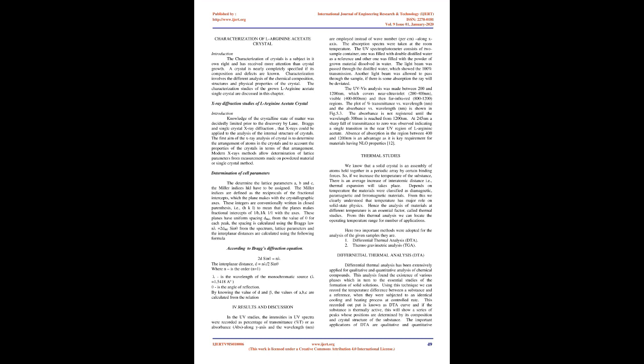X-ray diffraction studies of L-Arginine acetate crystal. Introduction. Knowledge of the crystalline state of matter was decidedly limited prior to the discovery by Laue, Bragg, and single crystal X-ray diffraction, that X-rays could be applied to the analysis of the internal structure of crystals. The first aim of the X-ray analysis of a crystal is to determine the arrangement of atoms in the crystal and to account for the properties of the crystal in terms of that arrangement. Modern X-ray methods allow determination of lattice parameters from measurements made on powdered material or single crystal method.